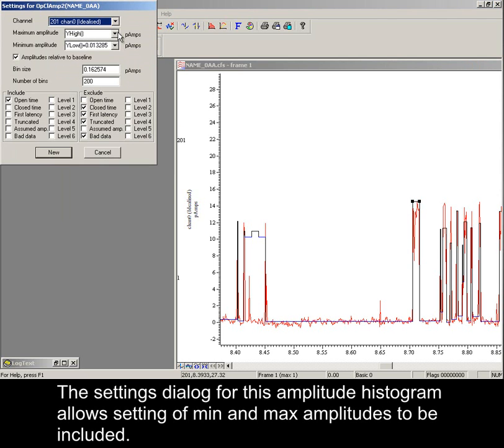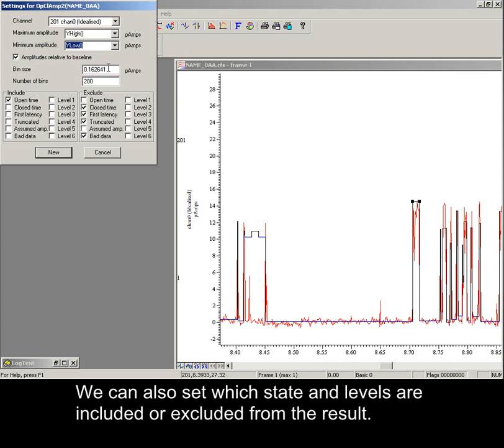The settings dialog for this amplitude histogram allows setting of min and max amplitudes to include. We can also set which state and levels are included or excluded from the result.